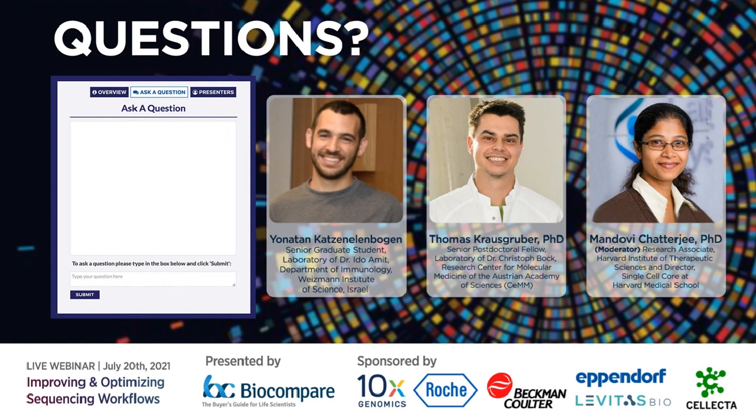And this actually can save you a lot of money later, because what people do not realize sometimes is that a bad quality sample can lead to a lot of read loss during sequencing. And that might cost somebody a huge amount of money and time during analysis.